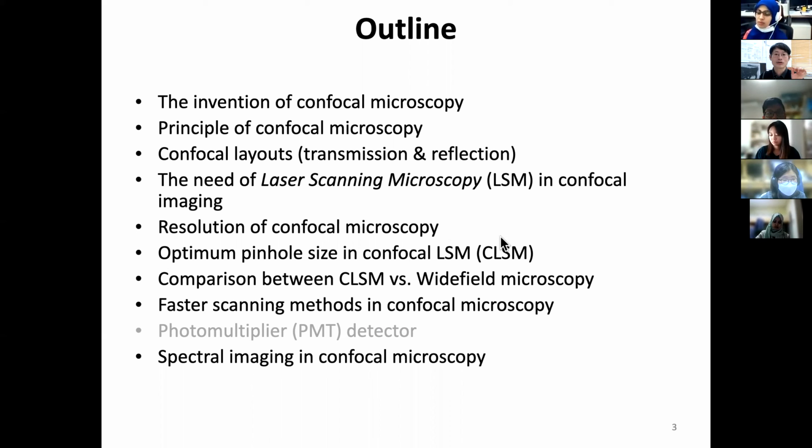And for that, the resolution is coming from a so-called pinhole, because the confocal actually needs a pinhole, and that pinhole size in practice is very much of an issue, whether you use a commercial confocal microscope or you are developing confocal microscopy yourself. And we had better compare with the confocal. Why is it somehow great compared to general wide field fluorescence microscopy?